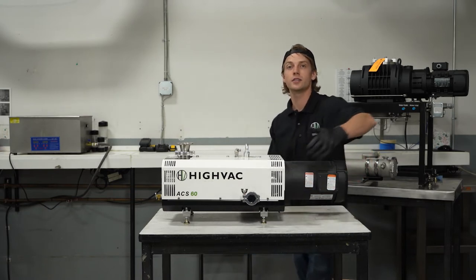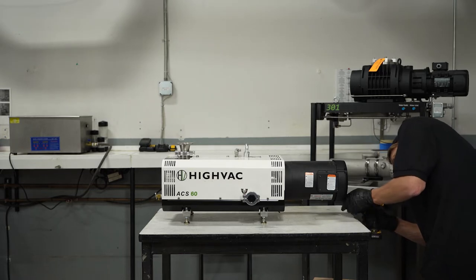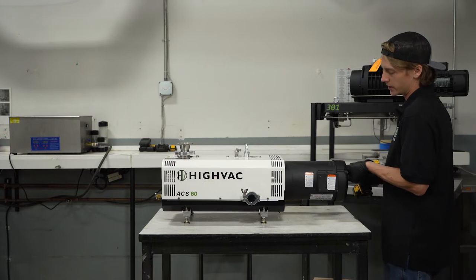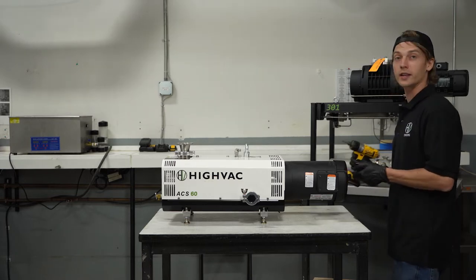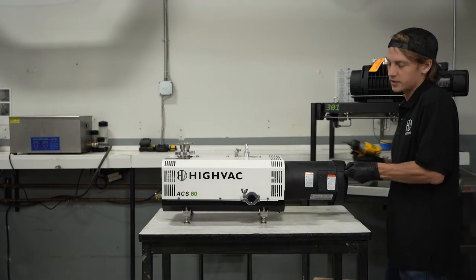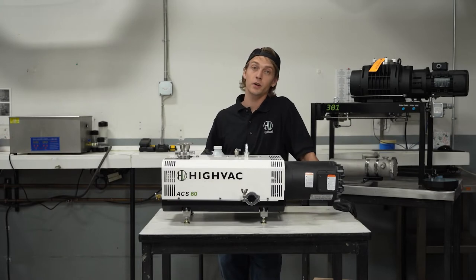The first thing you're going to want to do is go ahead and cap off your exhaust. Then we're going to remove the motor fan cover, and the reason we're doing this is so we can get at the motor fan and manipulate it by hand. This helps prevent damage and is a little bit gentler on the pump.